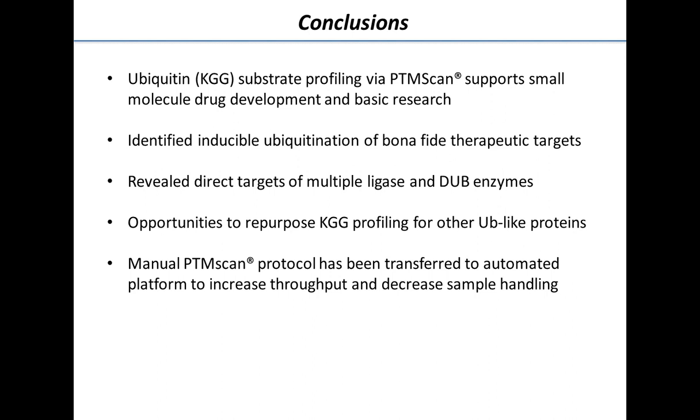So to conclude, hope Don and I have showed you today that we've been able to apply KGG PTM Scan to support many small molecule drug development projects as well as basic research. We've applied this technology, which has allowed us to identify inducible ubiquitination of therapeutic targets and allowed us to reveal direct targets of multiple ligases and enzymes.